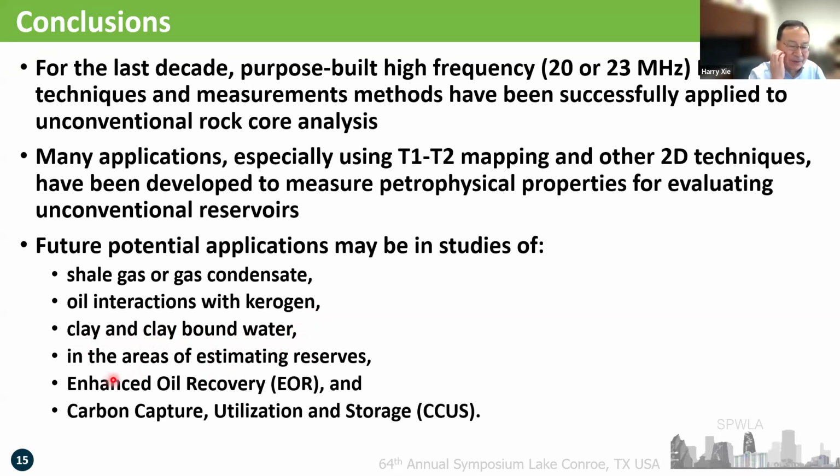And also, people want to understand porosity and the saturations. One of the biggest questions people keep asking is: is bitumen part of porosity or not? That's a big question, and you have to find a way to answer it. And there is also enhanced oil recovery, where NMR can play a big role.